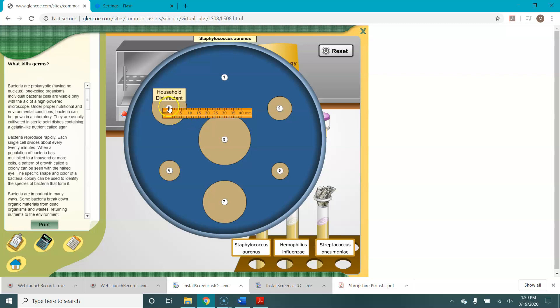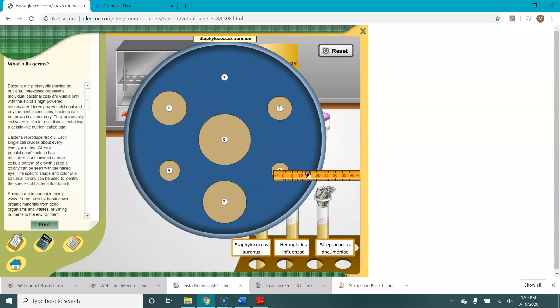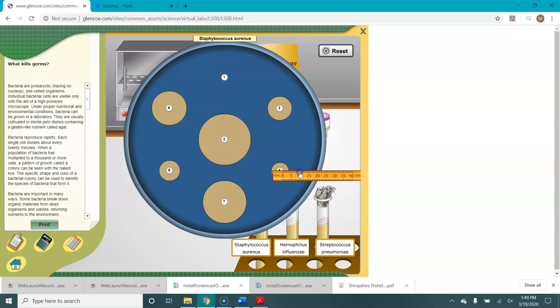So on disc number four, which is our household disinfectant, it looks like we have a zone of inhibition of about 13 millimeters. If we come to disc number five, it looks like we have about three. And that's our penicillin.